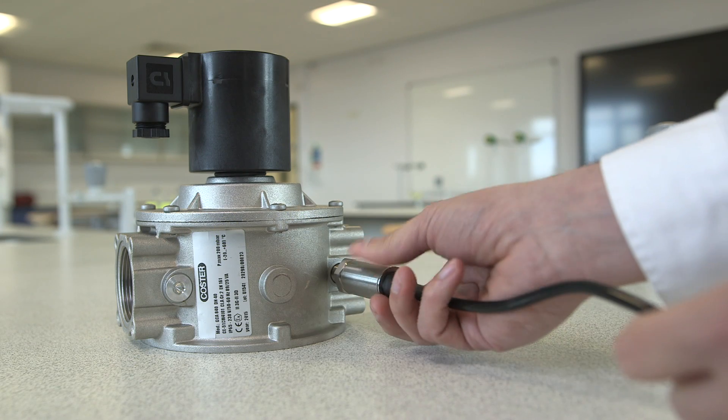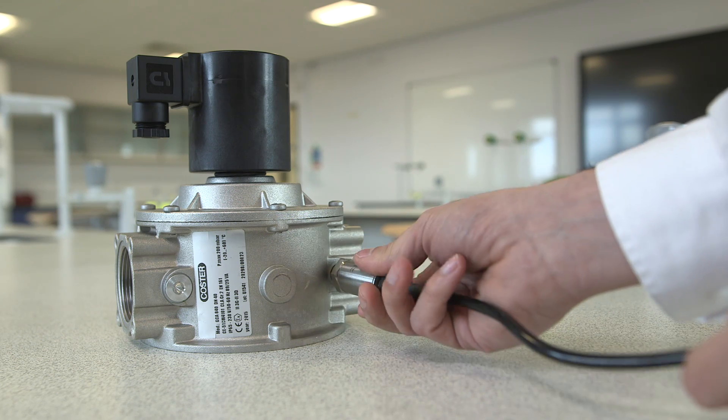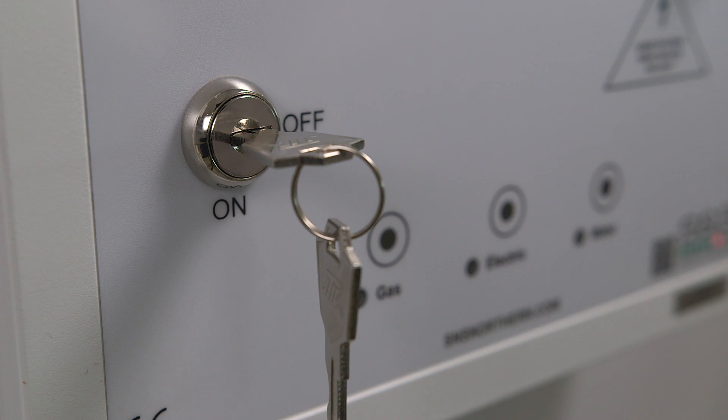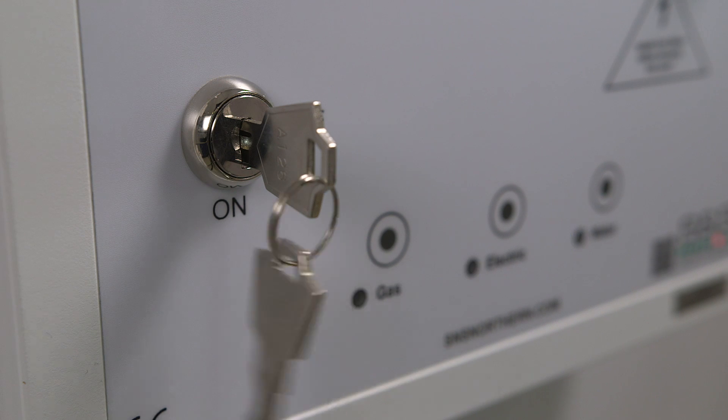Our unique pressure transducer is simply screwed into the gas solenoid valve. The educator or end user will need to investigate and identify the reason for the pressure drop. Once that has been resolved, the panel can be reset using the authority key.